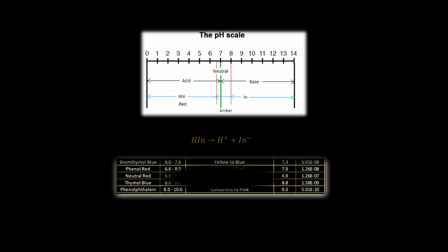The terms endpoint and equivalence point are quite often interchanged and understood as being the same point. However, they are not actually the same point, and this too must be understood. The equivalence point is a single point stoichiometrically, where the base solution neutralizes the acid solution.